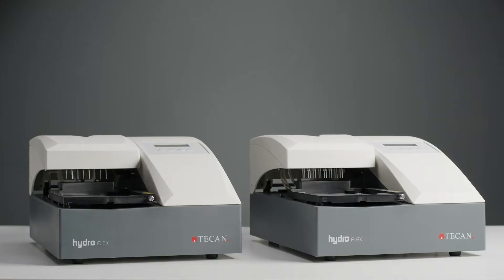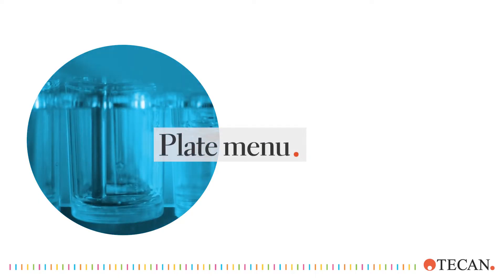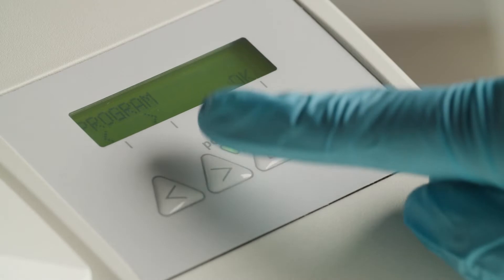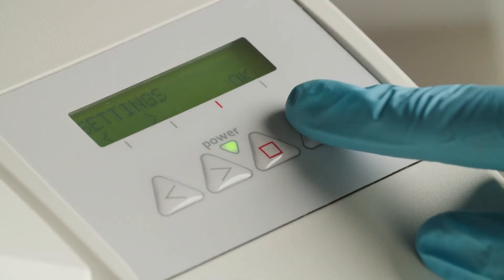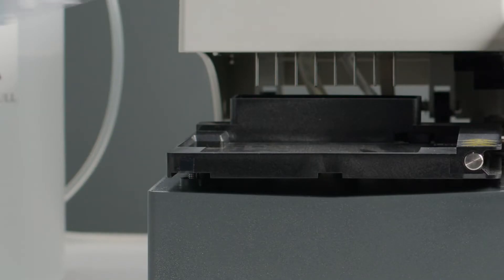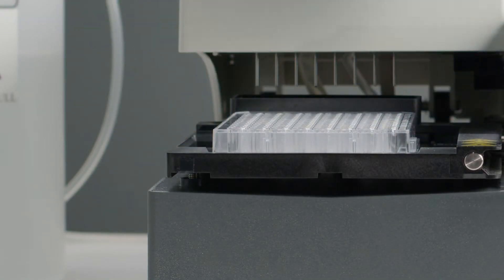If you have any questions about installing your instrument, check out the respective tutorial. Go to settings and open the edit plates menu to see all the plate definitions stored on the instrument. Place the desired plate on the plate carrier before starting the process.